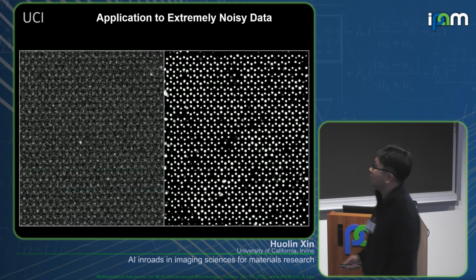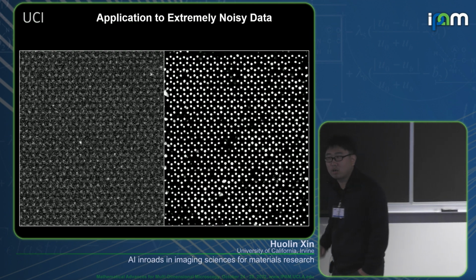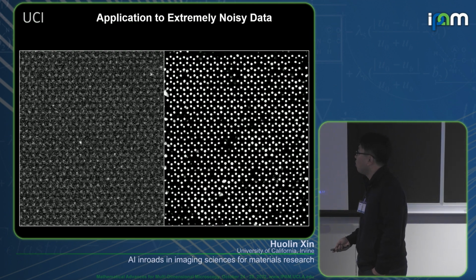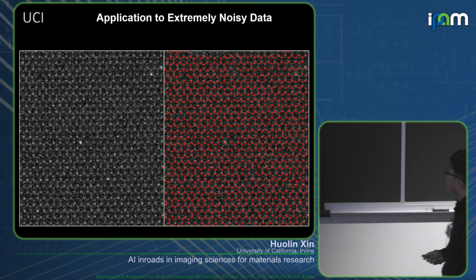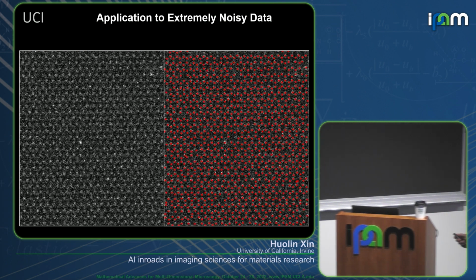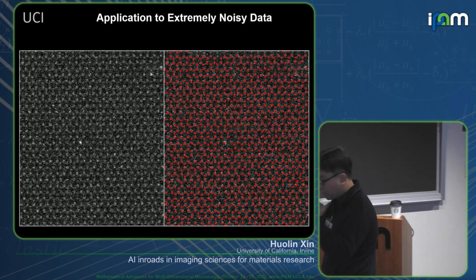Here's really what I call success. When I stare at this molybdenum sulfide image, I had trouble knowing where the sulfur atoms are, or whether there's one sulfur atom or two. This is what my neural network gives me. There's very high confidence. You can use this.